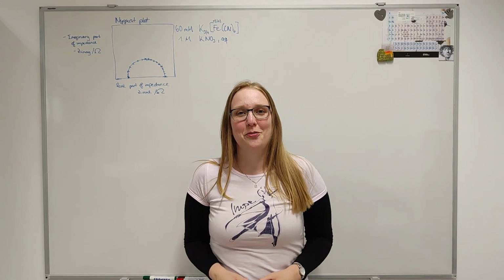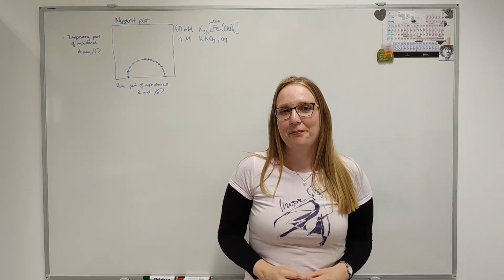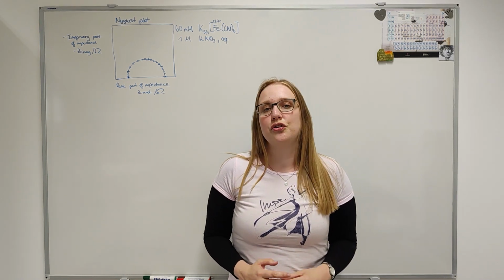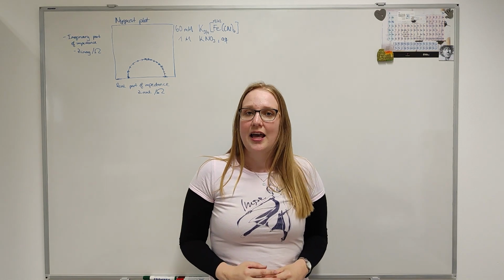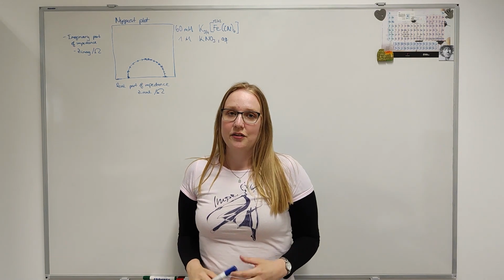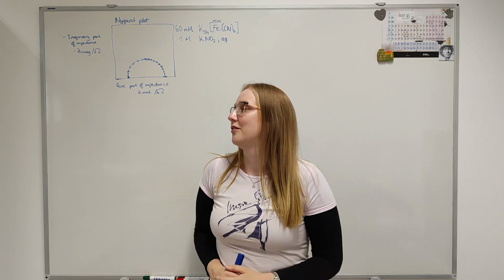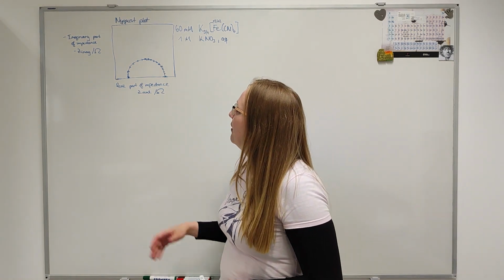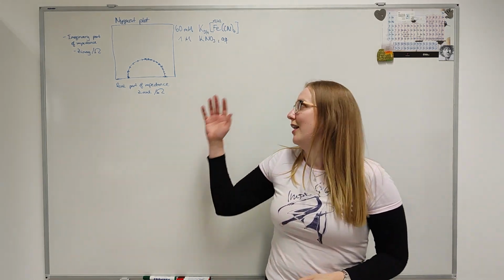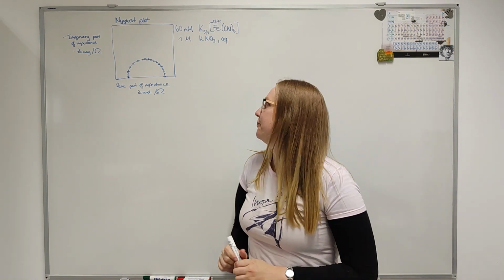Hi, welcome back to the whiteboard. So let's see what we can gain from Nastya's experiment in the lab. What she probed was the ferrocyanide redox couple in solution with a supporting electrolyte. And the impedance spectra she recorded looked like this. So we had the semicircle, which may look familiar to you after our previous video and the scenes we started with. So let's think what electrical equivalent we could find for this electrochemical system, which gave us a semicircle in the complex plane.